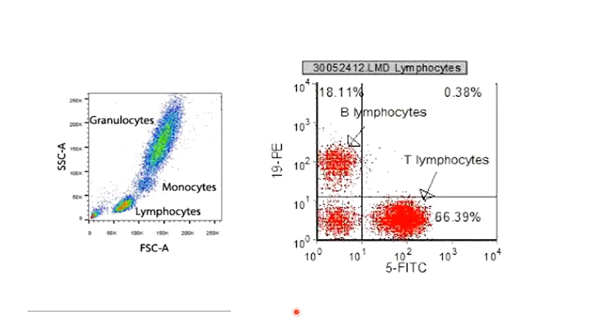Reason is very simple. These colors are having wavelengths near to each other, and when they have wavelengths near to each other, these wavelengths can mix with each other, and it is very difficult to separate the colors or observe the colors easily, right?